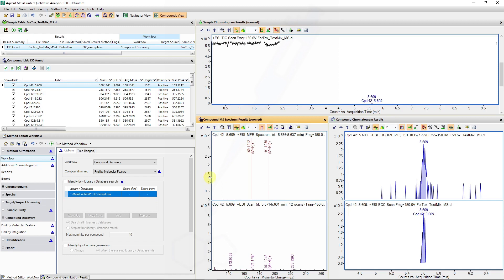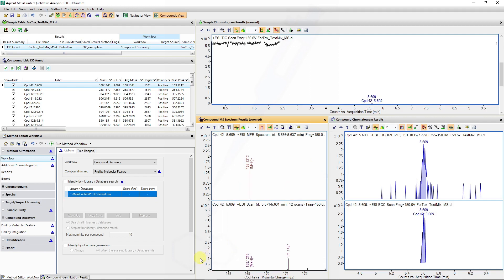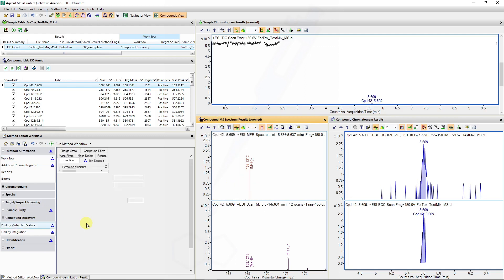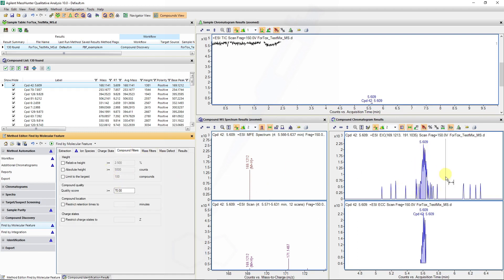For compound 42, we can see two ions have been found — one as a protonated adduct and the other as sodium. The area thresholds are currently set at 1700, and that value applies to the spectral data — the MS spectrum results. Setting this value higher allows us to exclude certain low-intensity masses. The compound filters apply to the peak heights and peak areas you are obtaining.